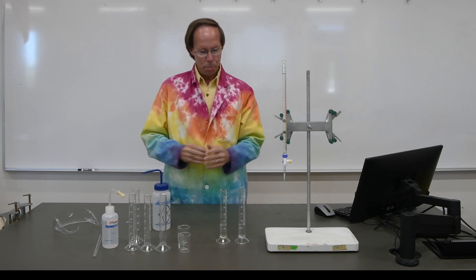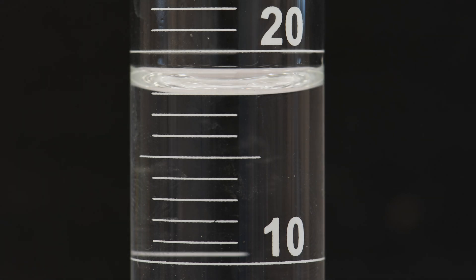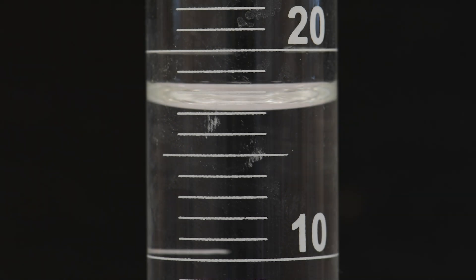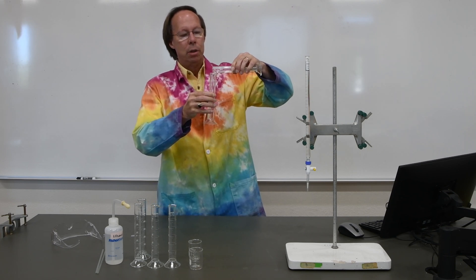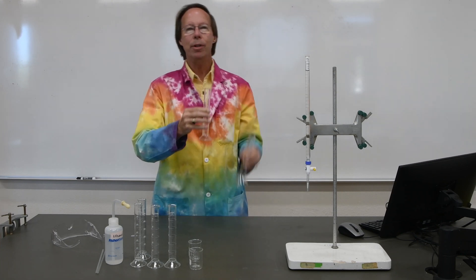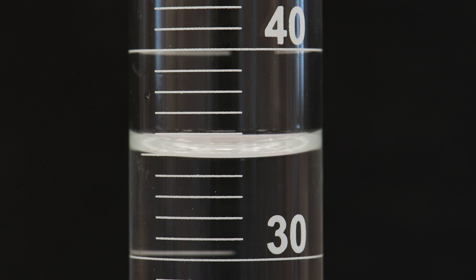Now let's take a moment and measure those volumes, then we'll combine them and measure them again. This is the first graduated cylinder with water — record the volume in your lab book. This is the second cylinder with deionized water. Now that we've measured the individual volumes in each of the two graduated cylinders, let's go ahead and combine the two. We'll try to pour all of the water to reduce our error. Now record the combined volume and see how that compares to the value you get when you simply add the two volumes together.